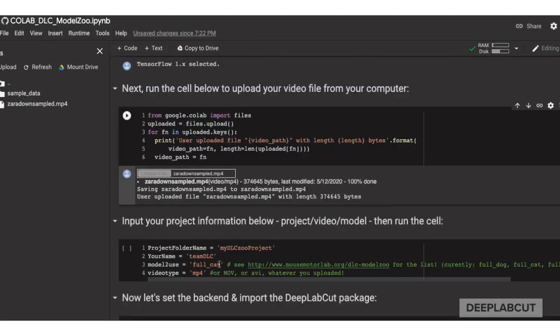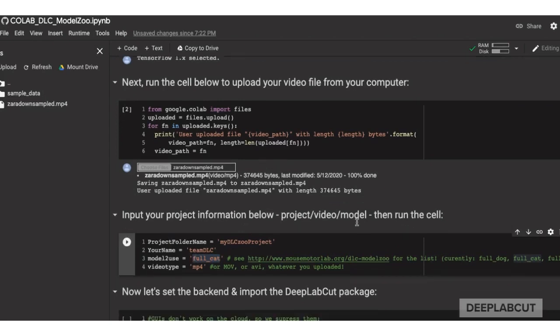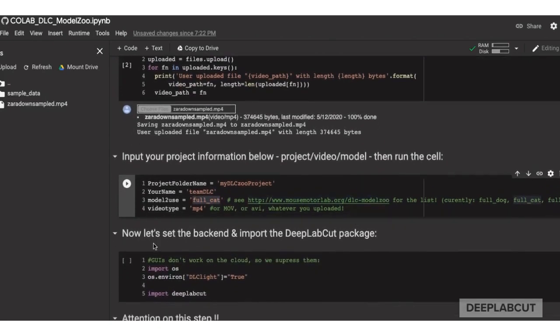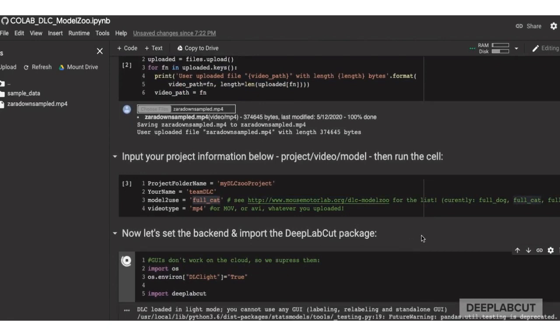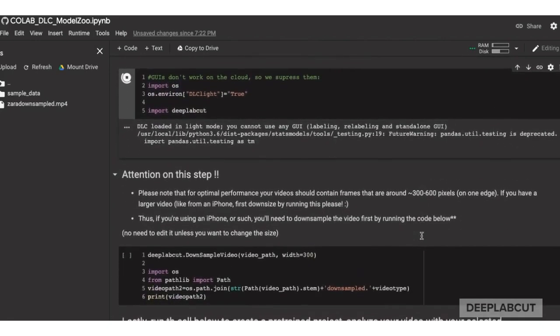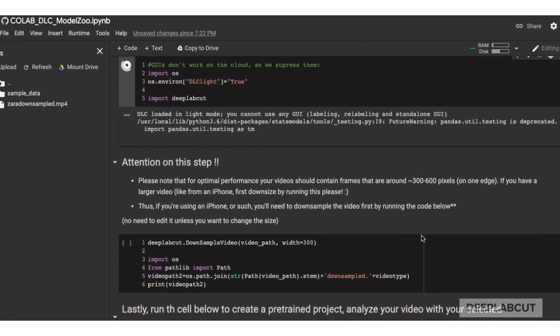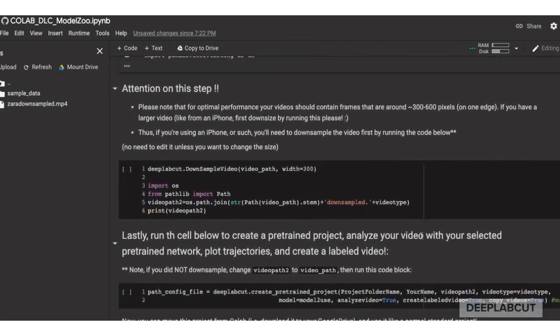Once you have your video uploaded, now you can set these variables, namely your project folder name, your name, the model to use which you can look up on our website of the currently available models, the video type, then we'll import Deep Lab Cut.